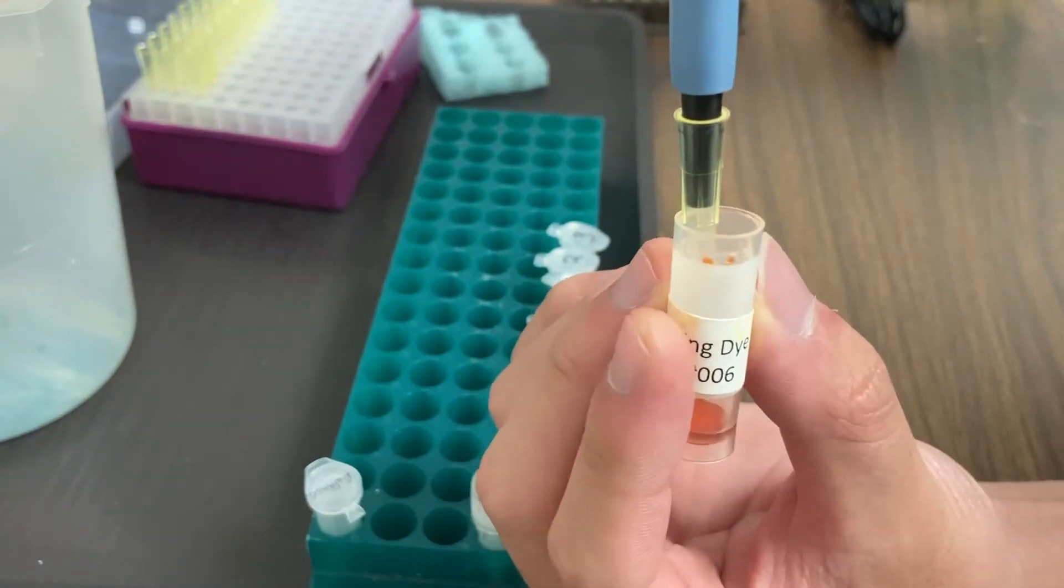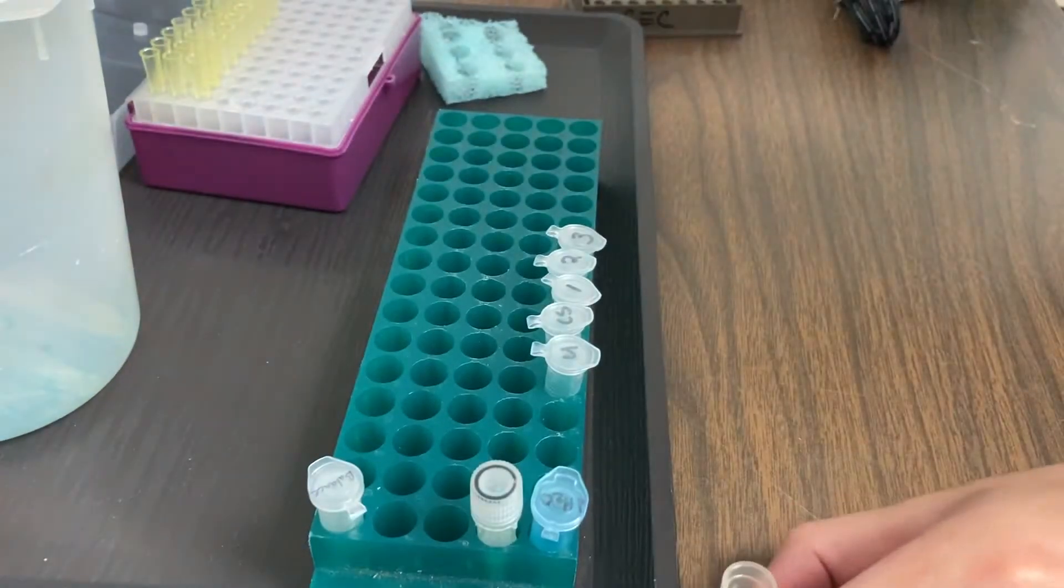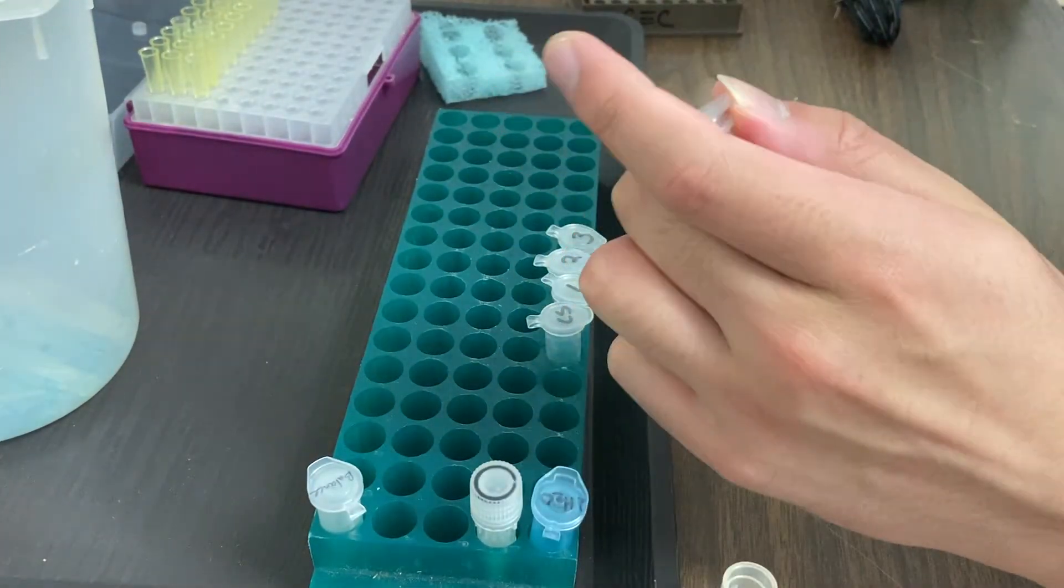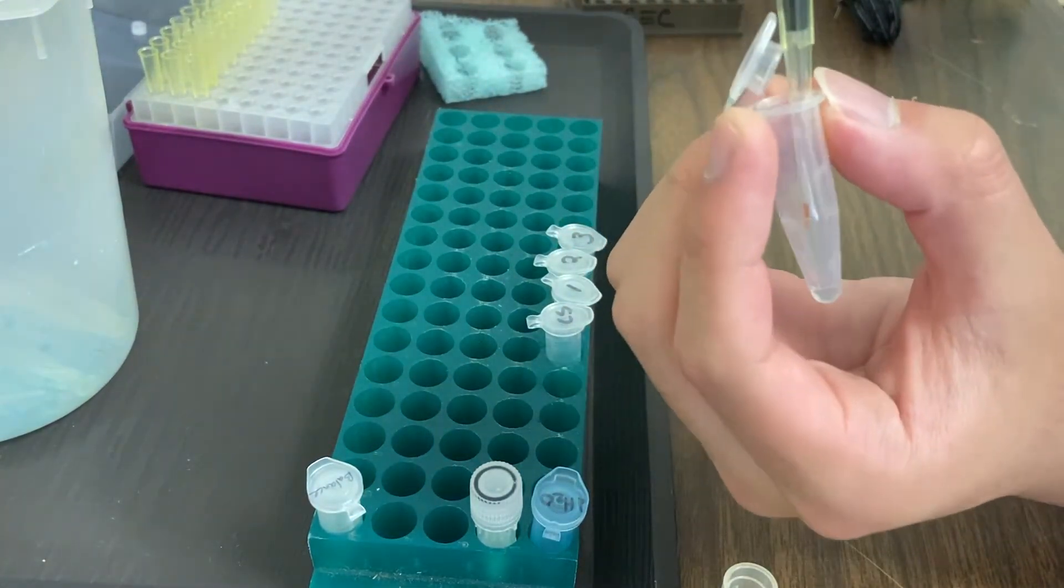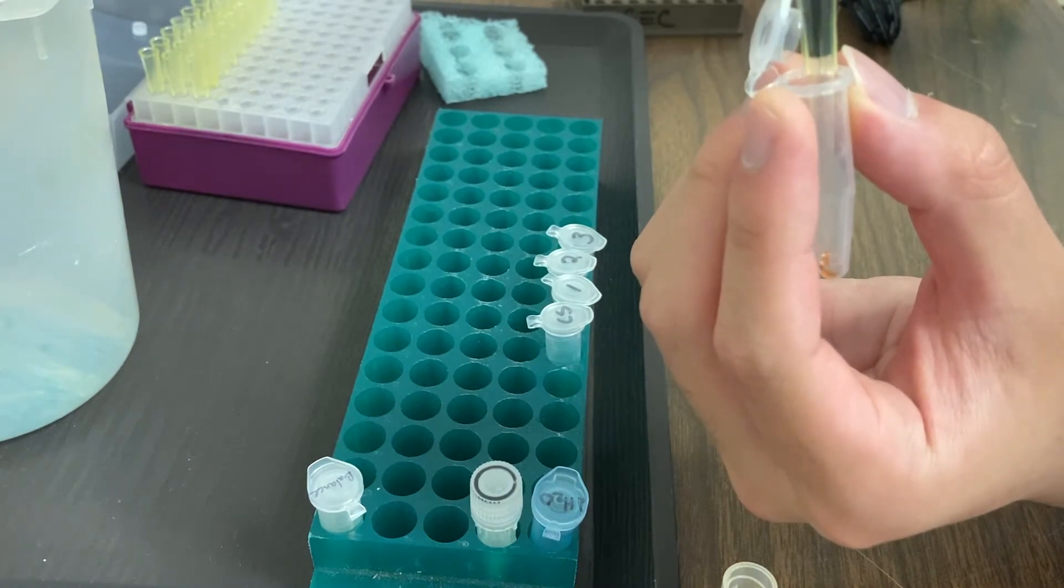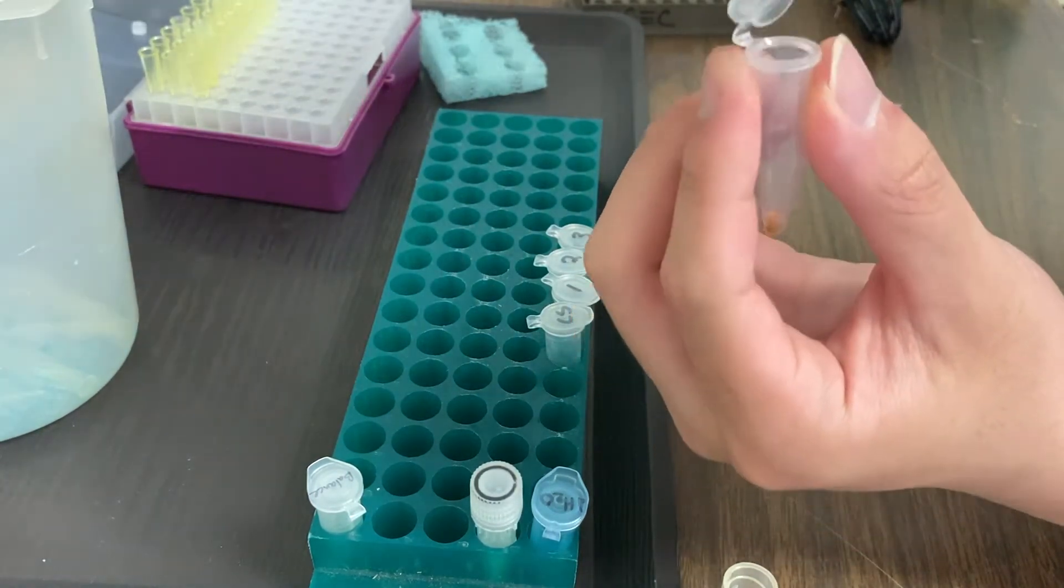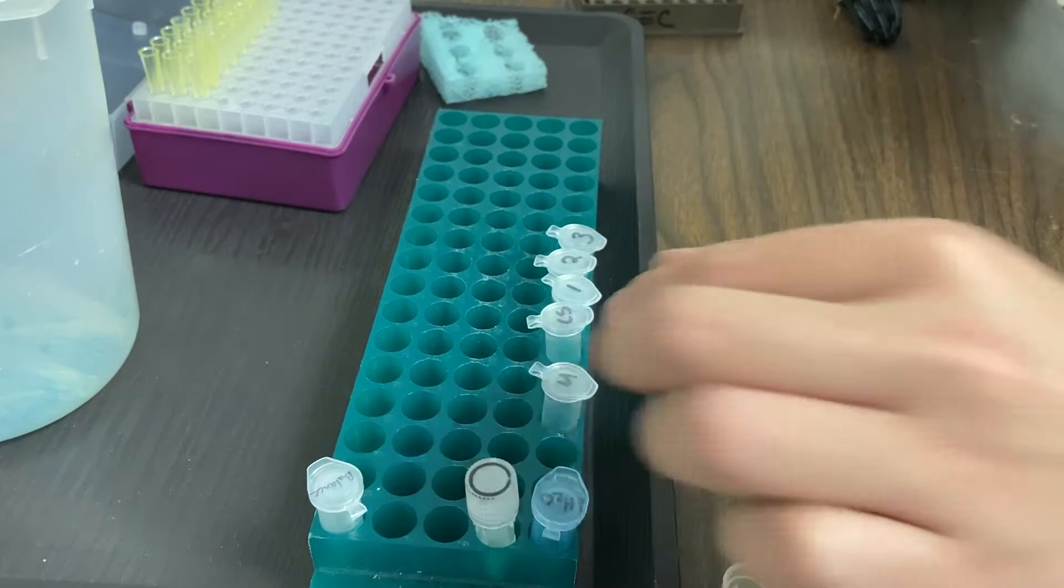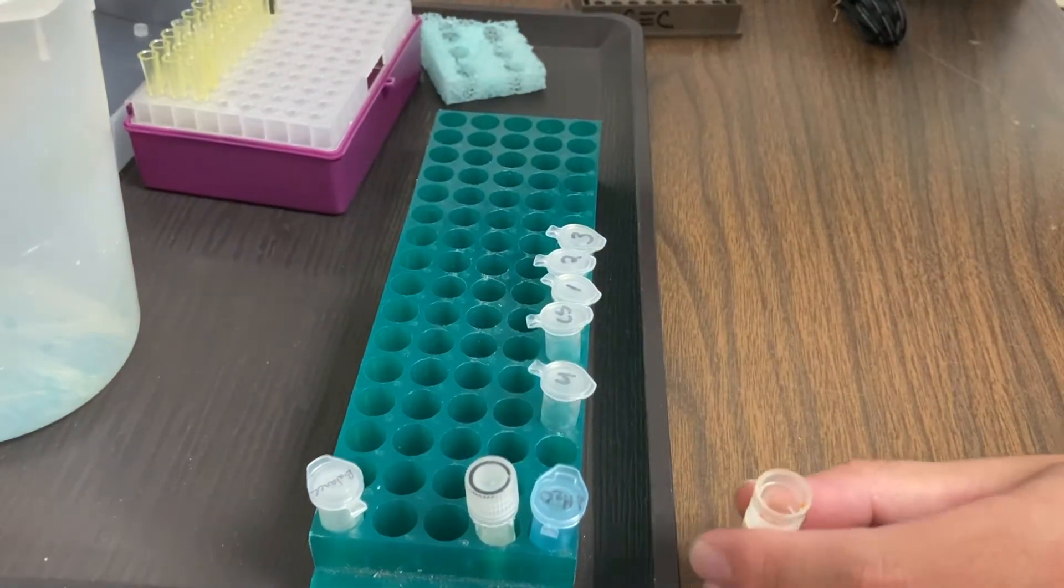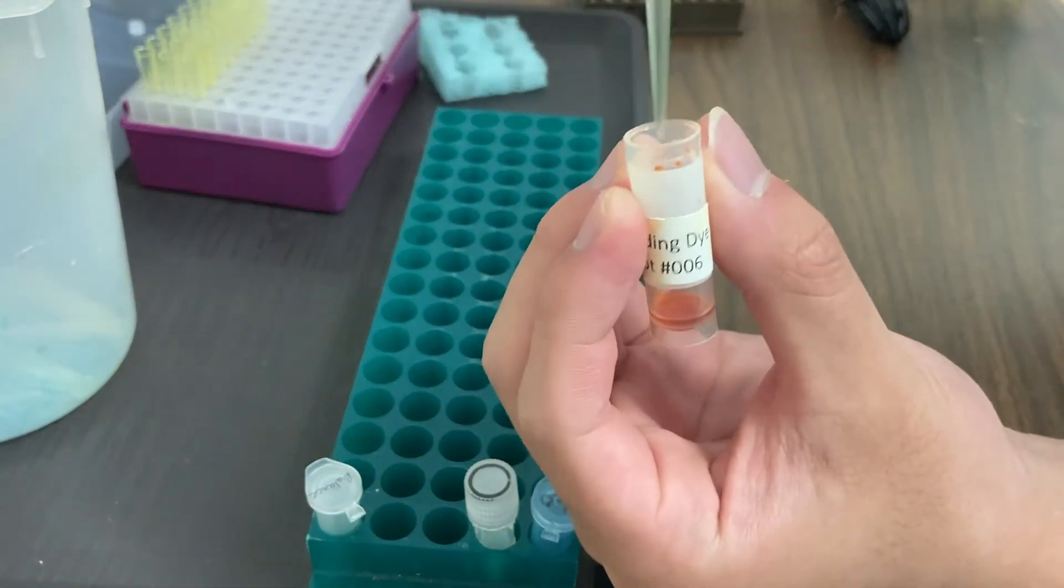If you remember, I said we're doing two microliters, which is actually a really small amount. So we're going to put the loading dye all the way to the bottom of the tube to make sure that it mixes with our restriction digest. Now make sure that we switch our tips because we don't want to mix up our sample's DNA.